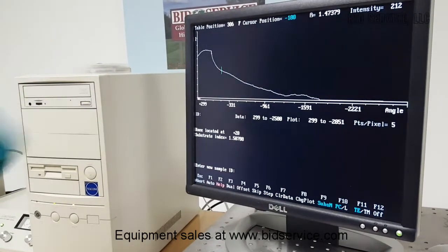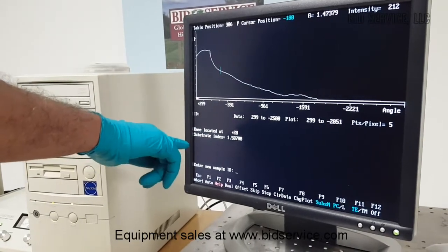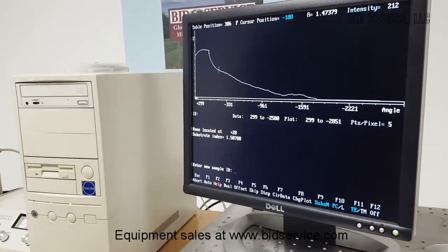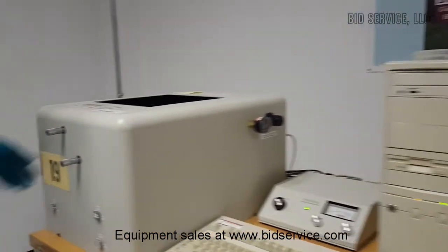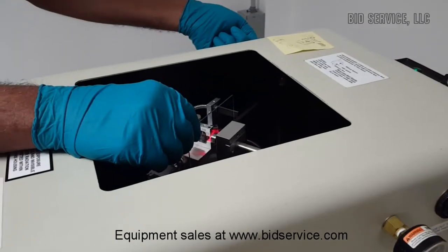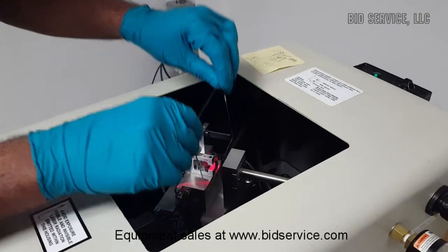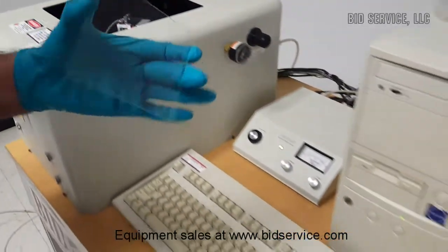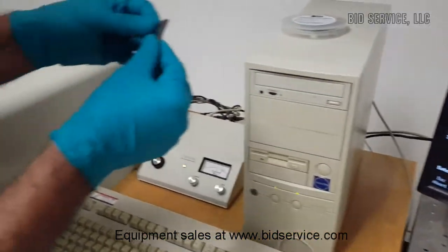So that one demonstrates that the third laser, which is the helium neon laser, also works to measure the substrate refractive index. While it is printing, I'm going to change the substrate. First I turn the pneumatic switch to the off position, the plunger is out, and my sample is out. This was the glass sample I was using. Now I'm going to switch to the second sample.